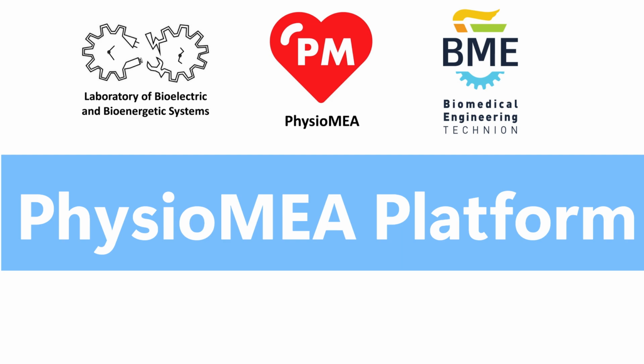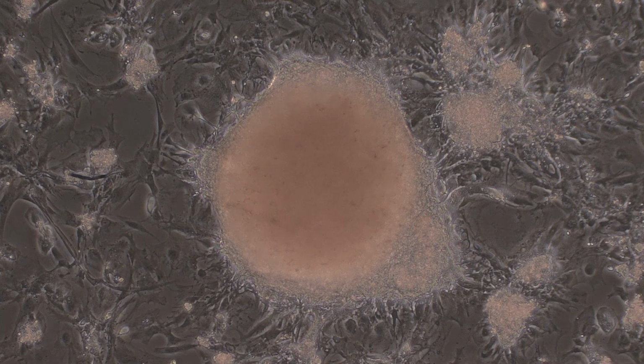Welcome to PhysioMEA, a novel, open-source platform designed to advance the analysis of multi-electrode array electrophysiological data. Our journey begins with the creation of a cardiac organoid. Here, you can see a spontaneously beating cardiac organoid. With every gentle pulse, electrical activity spreads through it.